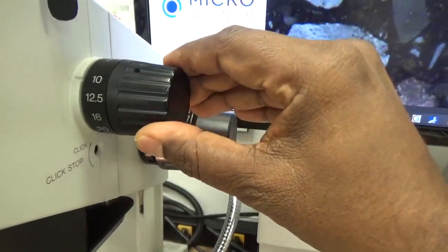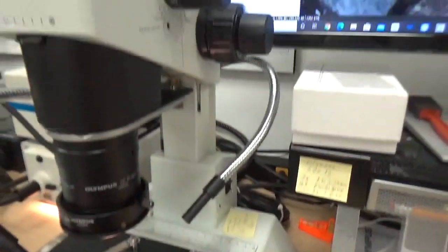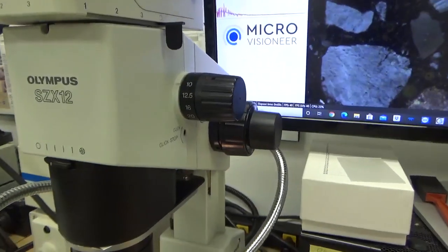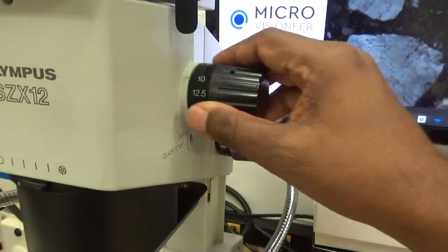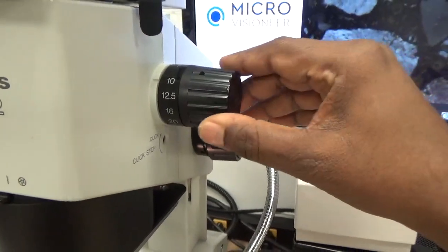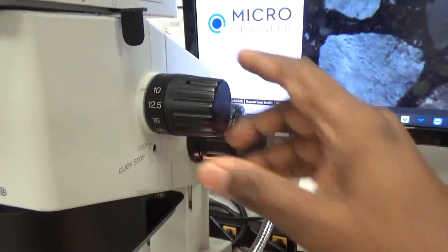At 10x magnification, we can scan the entire thin section in 5 to 6 minutes, and we get a very high resolution scanned image, which we can magnify for a specific area of interest, and we can crop different areas of interest and still retain a good resolution. So 10x is kind of a sweet spot to do the scanning, and we stay at 10x magnification. You can choose any other magnification, you just have to set the preset for that.